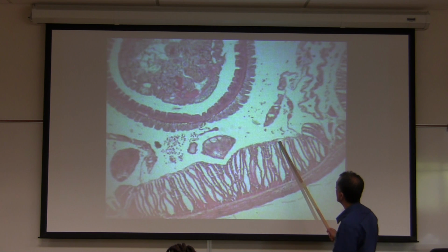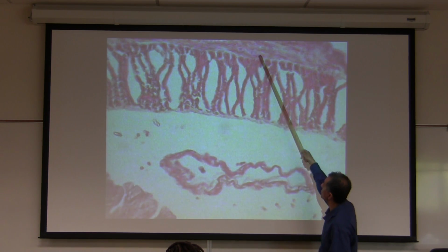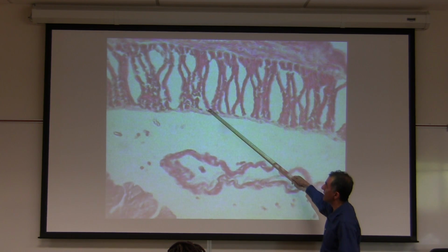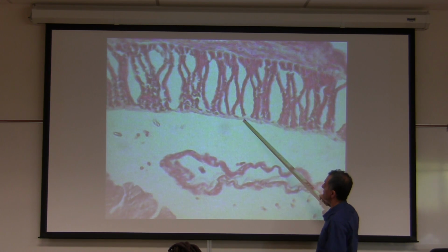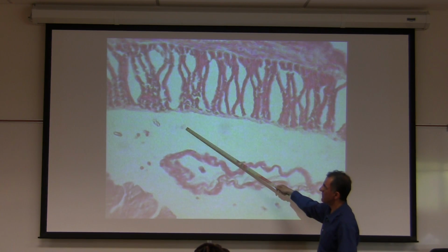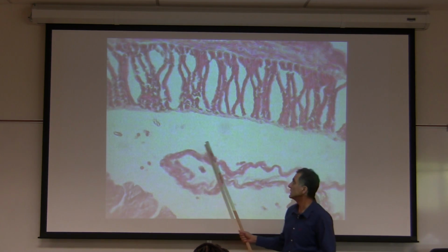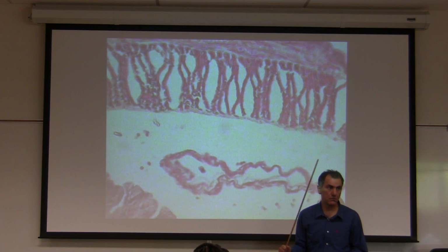Blood vessels. Same thing as the other slide right here. Longitudinal muscles, circular muscles on a high magnification. What is the name of the structure? You see that? The peritoneum. And that space is surrounded by all of this. So this is a coelomate animal. Okay.